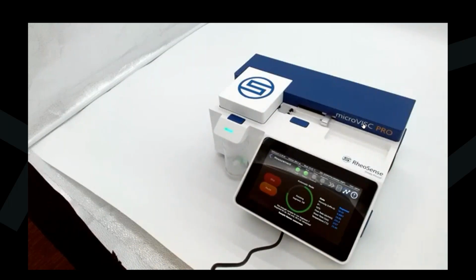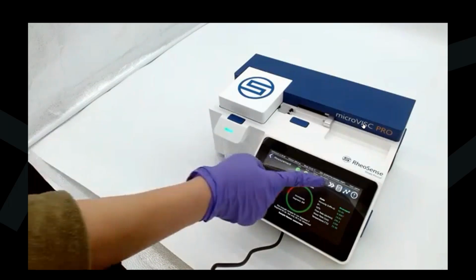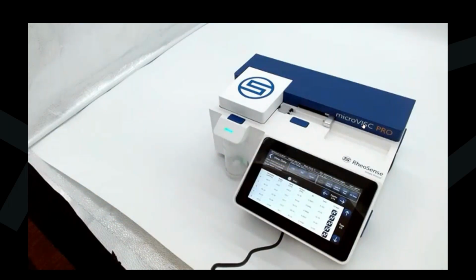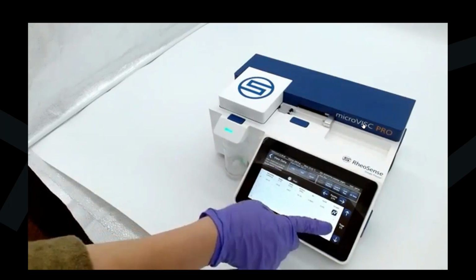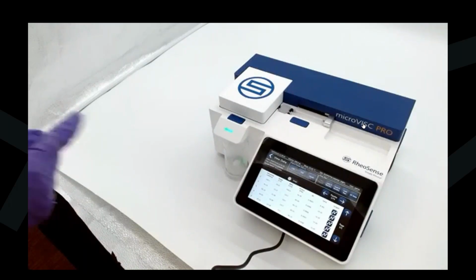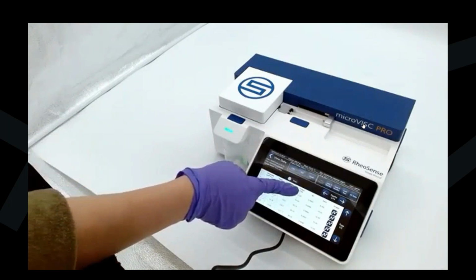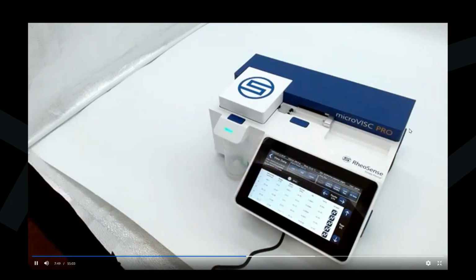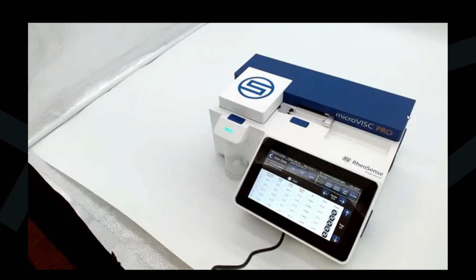So now after the pusher block goes back to home position, we're going to look at the data table that shows all the results we got. So let's go ahead and select that part. And here we can see the table of all the data you just took. It's showing you the viscosity, temperature, shear rates, even the stress, the R squared, which is a gauge of the quality of your data. So here it's very good quality data. And you can see the percent full scale.